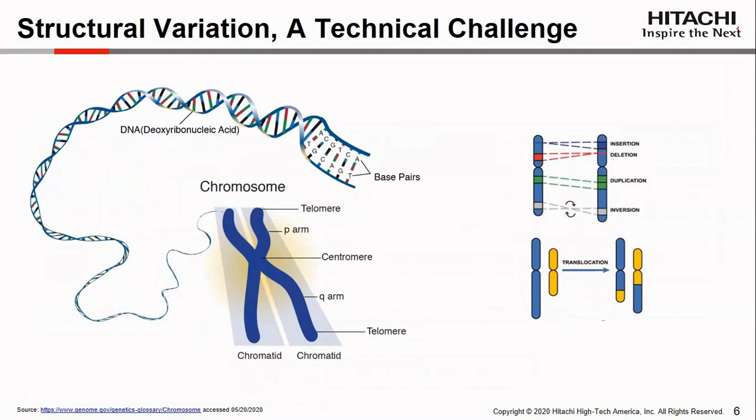It's the space in between sequencing and karyotyping that still represents a major technical challenge when analyzing structural variation in the human genome. And for good reason. Structural variation is multidimensional, spanning from unbalanced events such as insertions and deletions to balanced events such as inversions and translocations, to copy number variation, all the way to complex events such as chromoplexy, chromoanasynthesis, and chromothripsis.